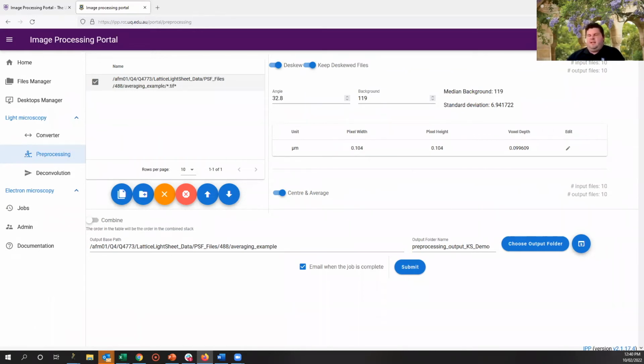Whereas if you open that same terabyte file into the Zeiss platform, it opens instantly because it's written to do that. Those high speed openers aren't really open source and available, which is why the route we've taken is to strip it down to another format, in this case TIFF, and then that can open very quickly because there are high-speed TIFF openers.